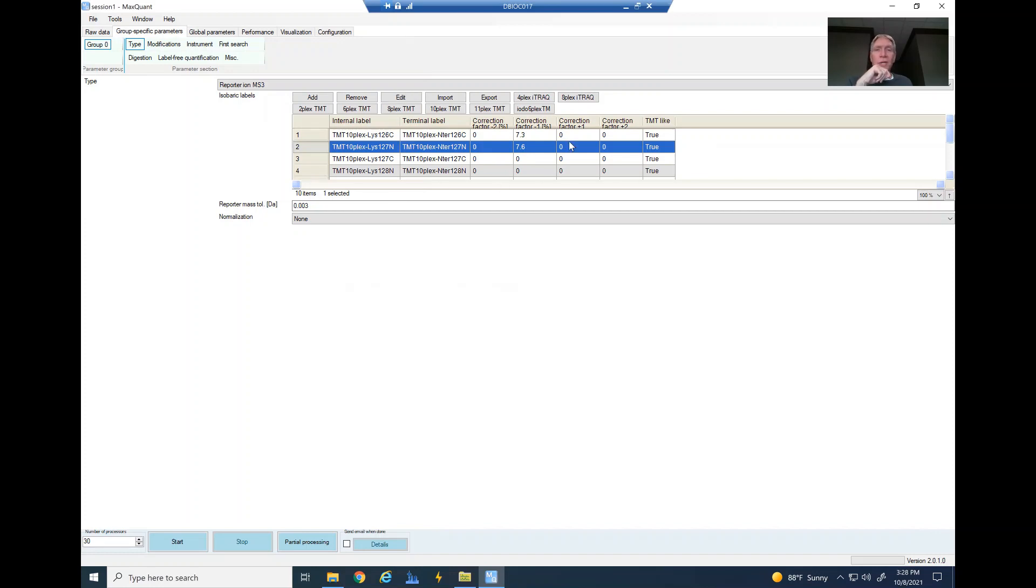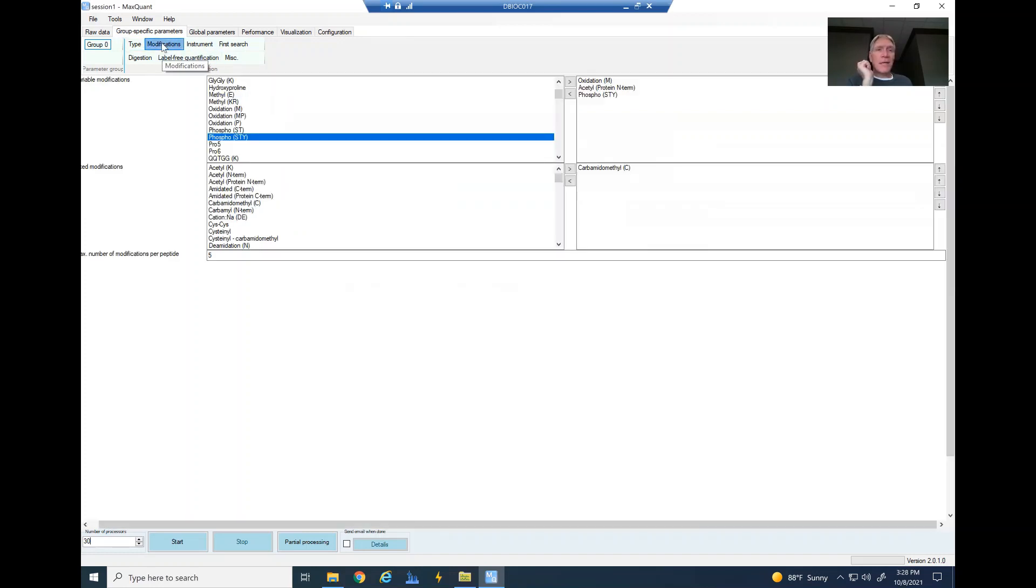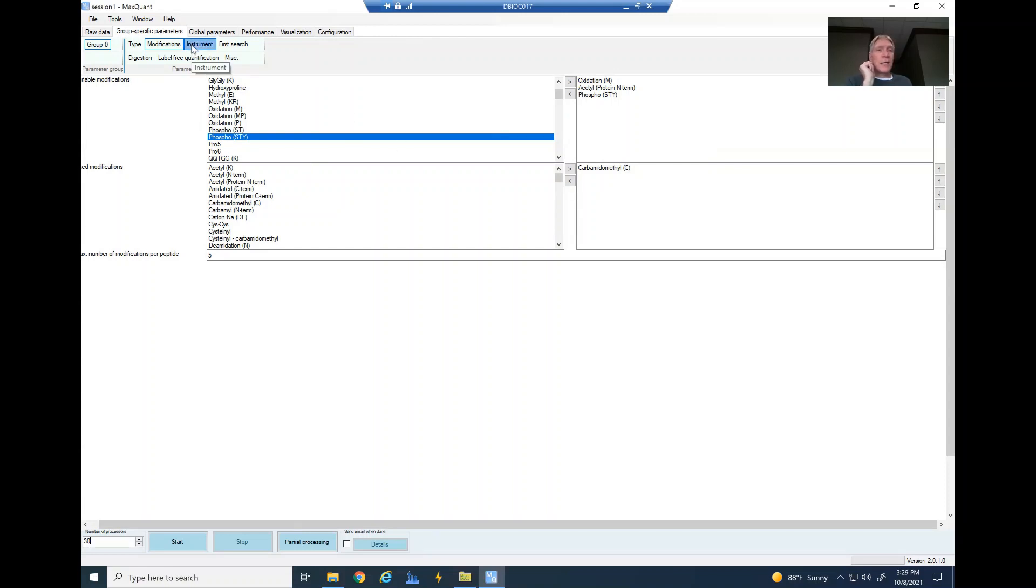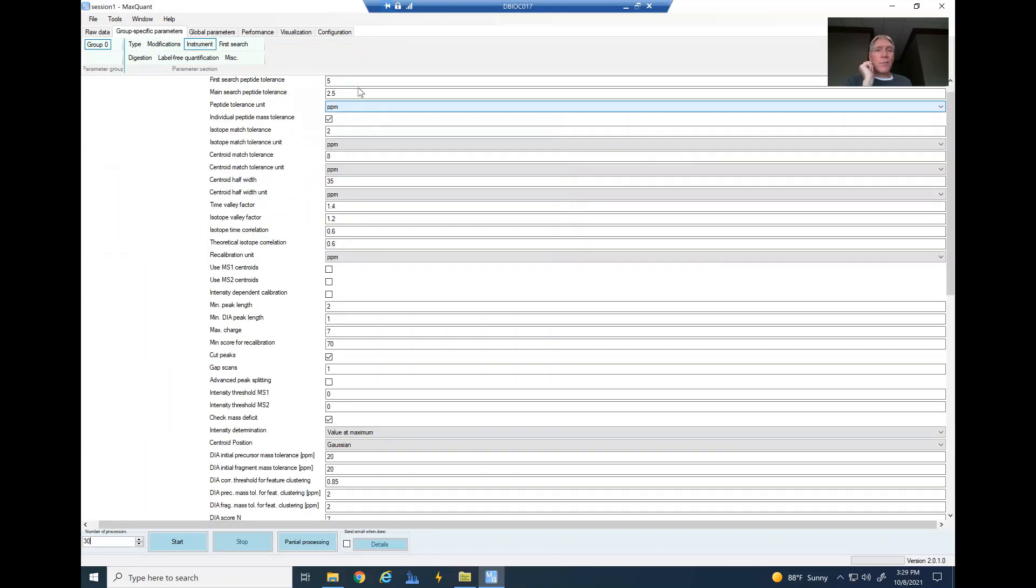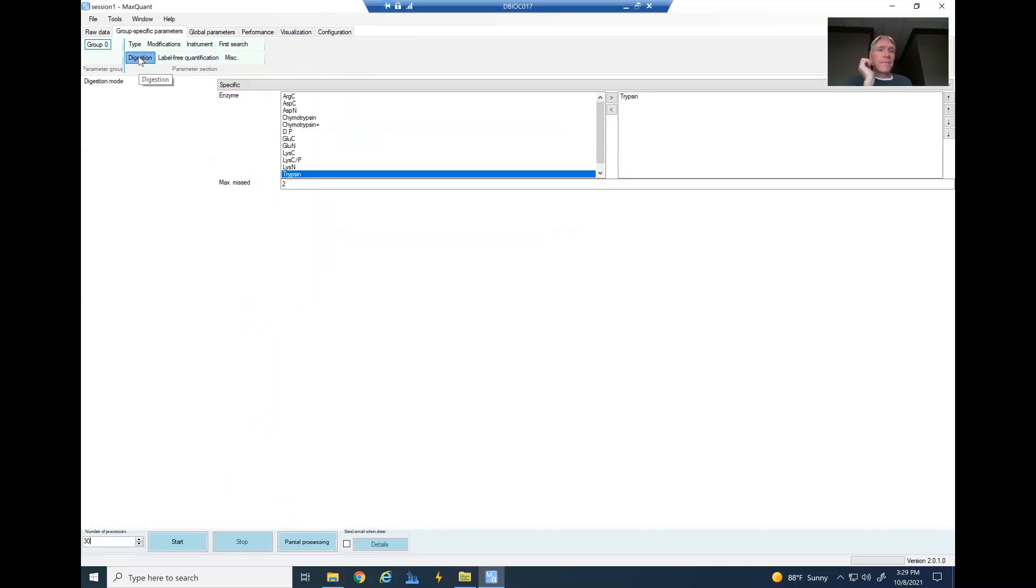Go to modifications—you can see that I've included my phospho with my other modifications. Instruments—I went ahead and changed those two things that I talked about. You don't have to; that's just what we do here. Digestion—changed it to trypsin here. You might be doing LysC or something else.